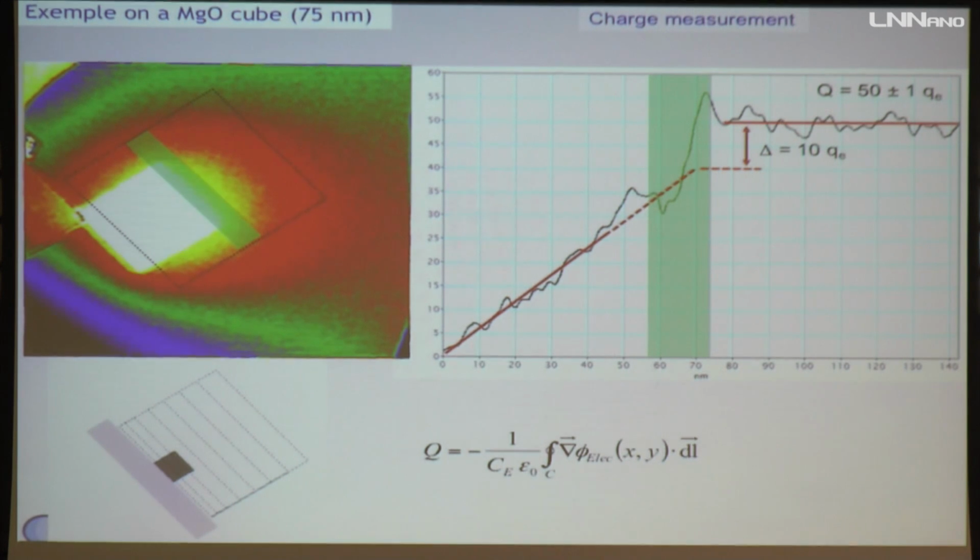So imagine you have a cube, okay? Well, this is a cube. When you are coming with your electrons, you are making this hologram analysis, and from the phase image, you are making some contours, and in the contour, you observe that you have n charges, and then you increase the size of the contour, and you observe another number of charges, etc. When you arrive at the very last surface of the cube, you have just one important step.